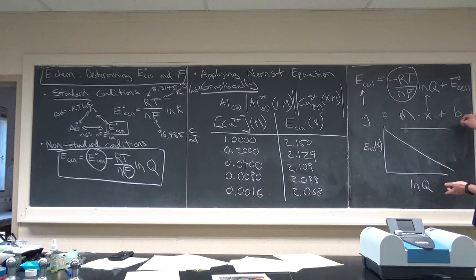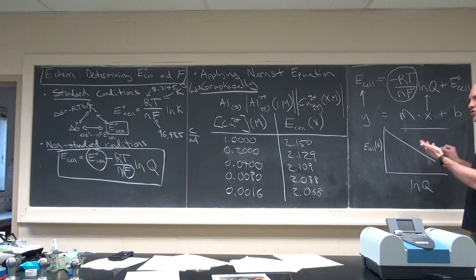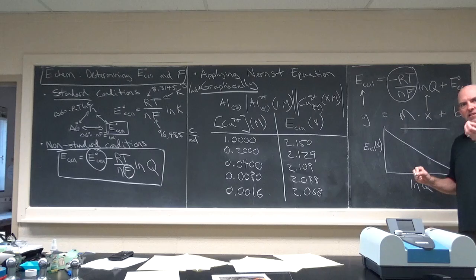You can go over the graph, click on things and put the axis titles, and then the trend line. And you can insert the equation, y equals mx plus b, and the correlation coefficient. We've done that before on the graph, or you can use the function equals SLOPE, enter the x and the y data. It doesn't matter which way you do it.